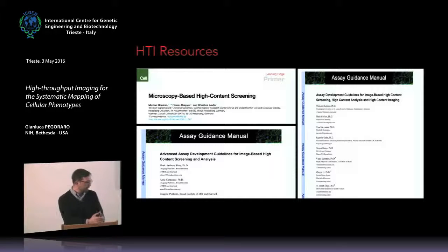And I started with a disclaimer. I'll finish with a disclaimer. What I showed you today are not the only possible applications of high-throughput imaging, and what I showed you is very much filtered through the lens of my experience and of the assays that we are running at a high-throughput imaging facility. There are a lot of other applications that this technique is good for, including screening of primary cells, 3D cultures, and so on and so forth. And I didn't really have the time to go through this today.